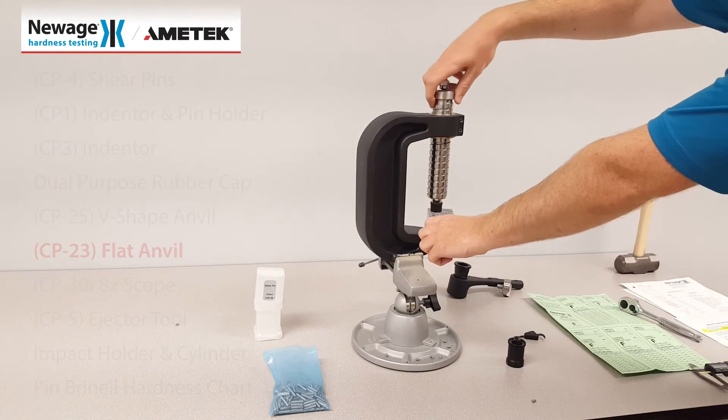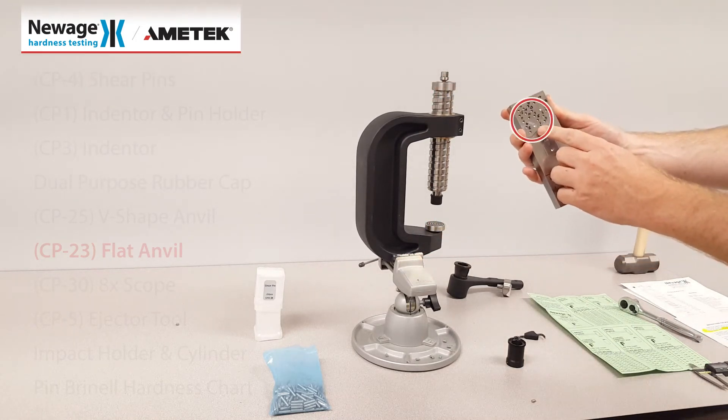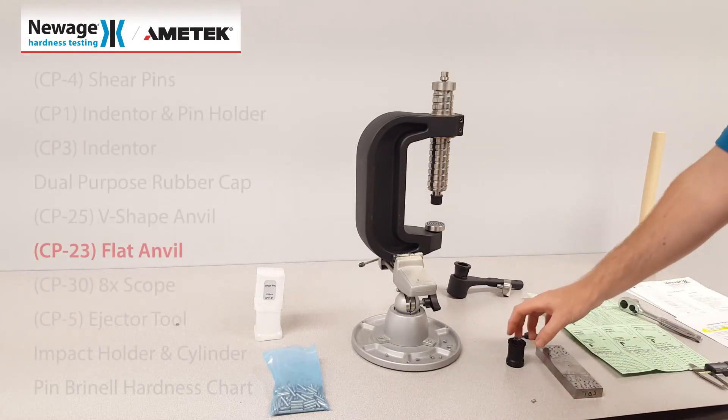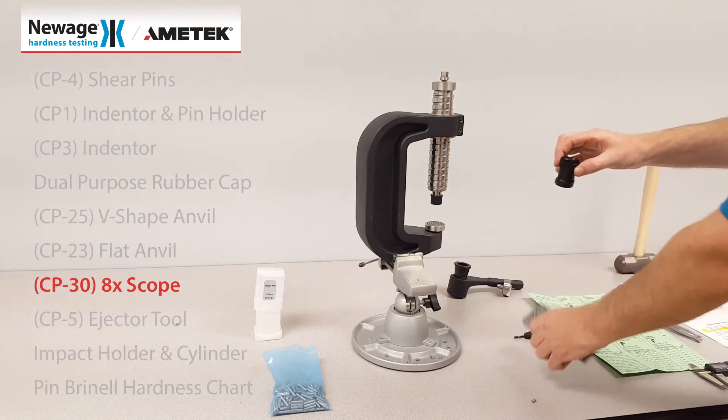Unscrew the large screw and inspect your impression. Included in the kit is an eight times scope for measuring your impression.